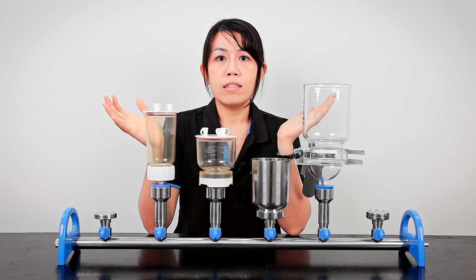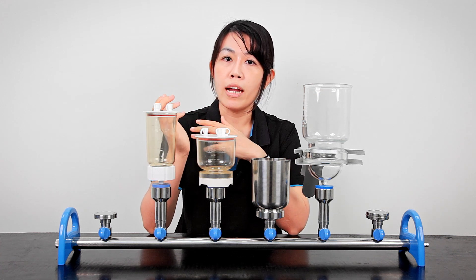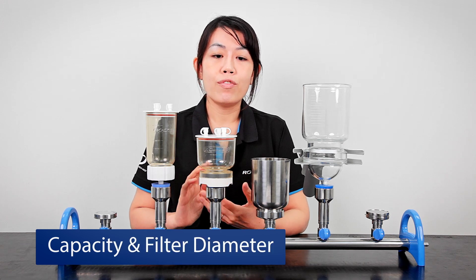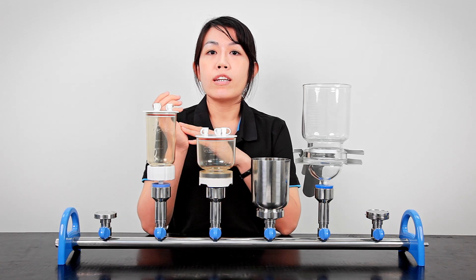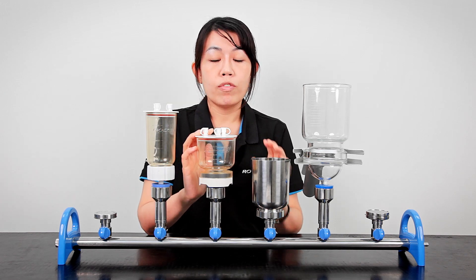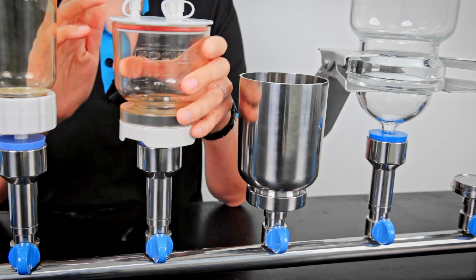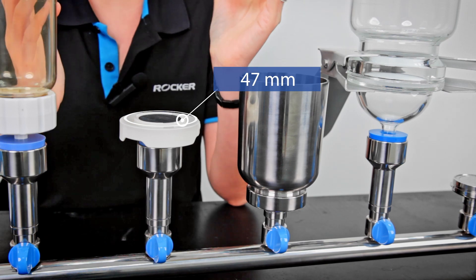With all these designs and different collections, I'm going to share some points to consider when deciding if a funnel is suitable for your laboratory and your work. The first thing to consider is the capacity of the filter funnels, which is usually dependent on the volume of your samples. If you filter less than 1000 ml per time, then a 300 or 500 ml filter funnel may be enough. These funnels usually come with a holder that can hold a 47 millimeter diameter filter, which is also the most common membrane filter size in the market.